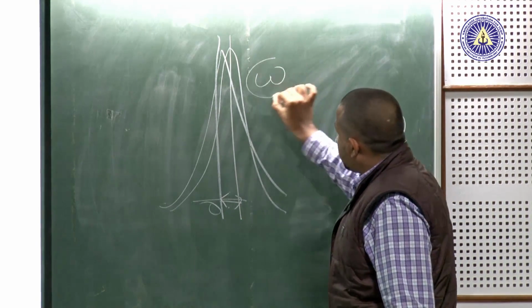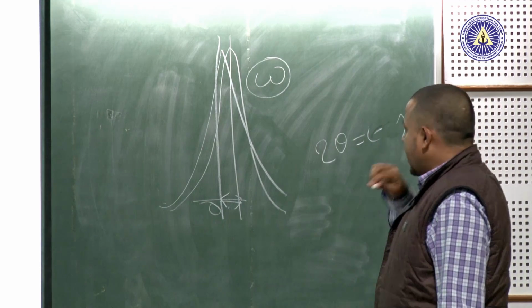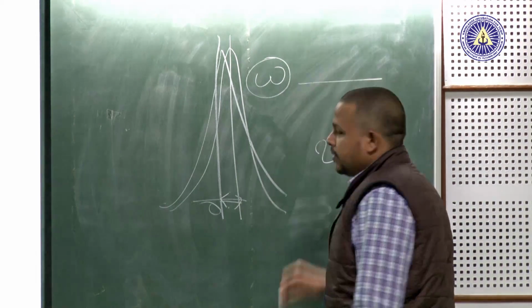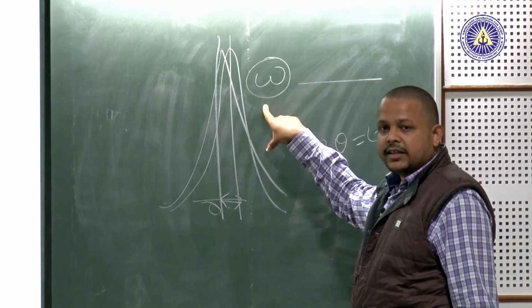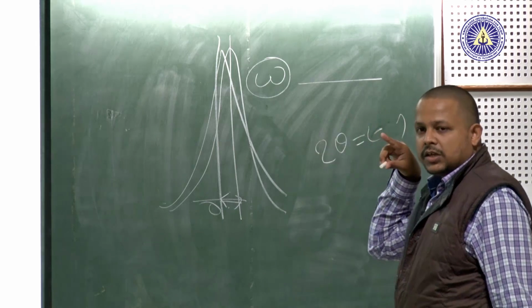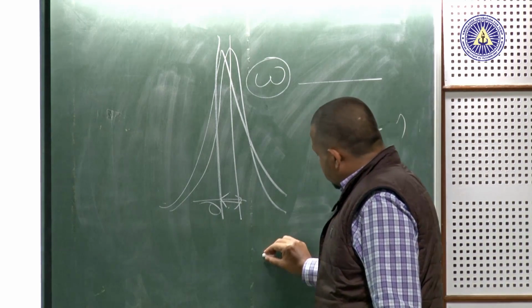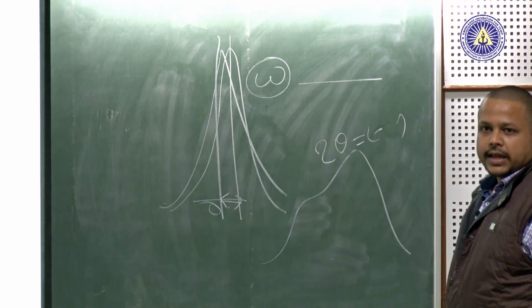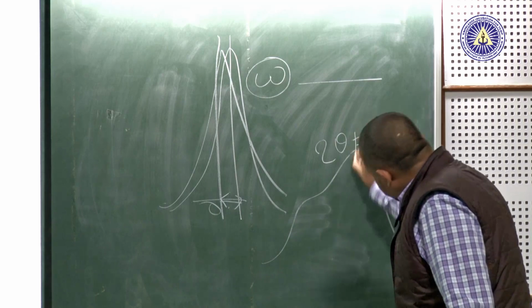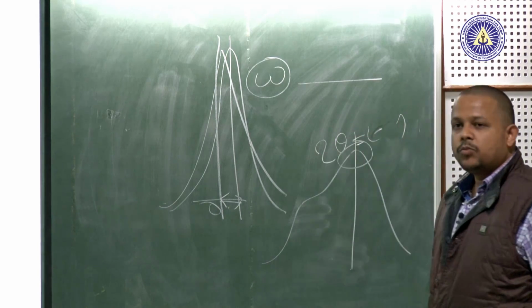It tells whether your sample is flat or not. It is a sample requirement. Suppose you have a flat sample, so you should do the omega scan. It tells whether the sample is flat or not, and in what region. Suppose the highest peak tells that in this region the sample is mostly flat.